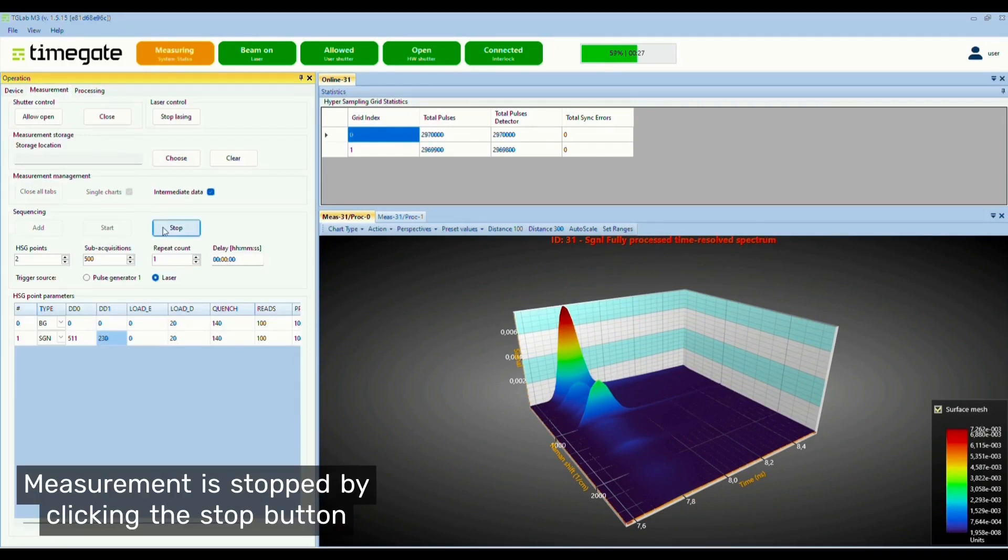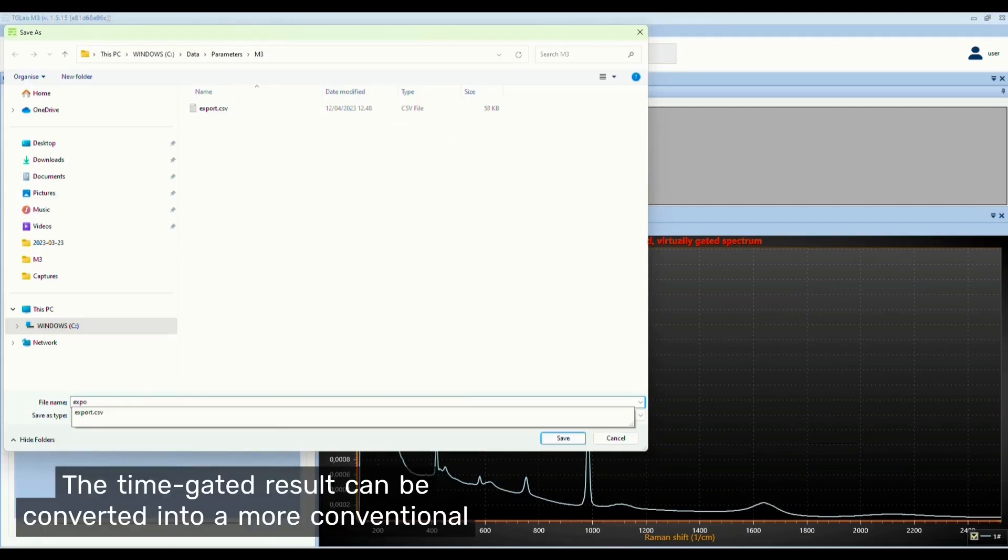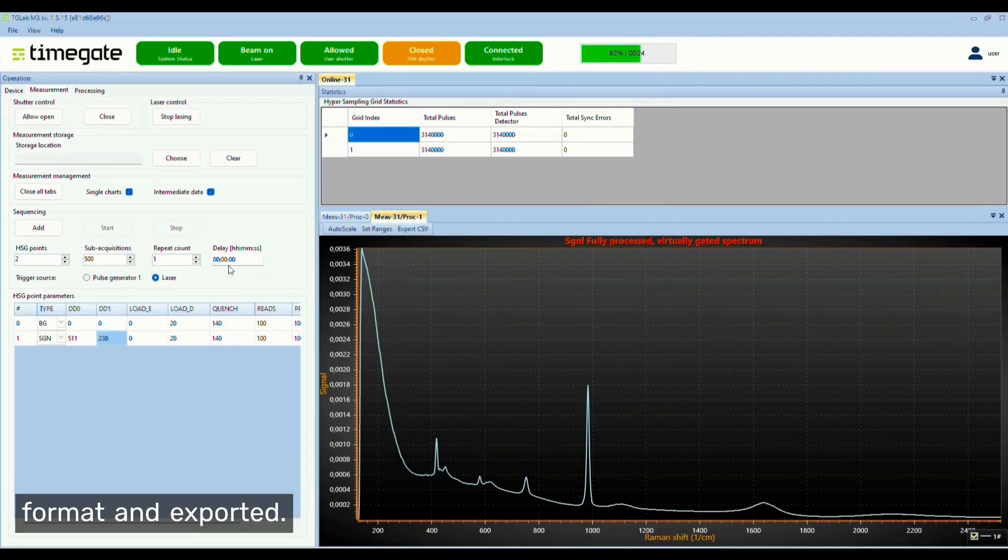Measurement is stopped by clicking the stop button or by waiting for the measurement to end. The time-gated result can be converted into a more conventional format and exported.